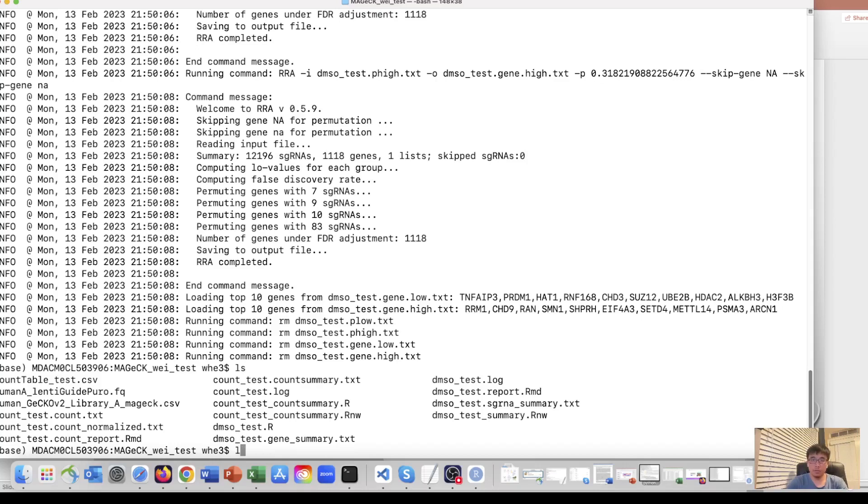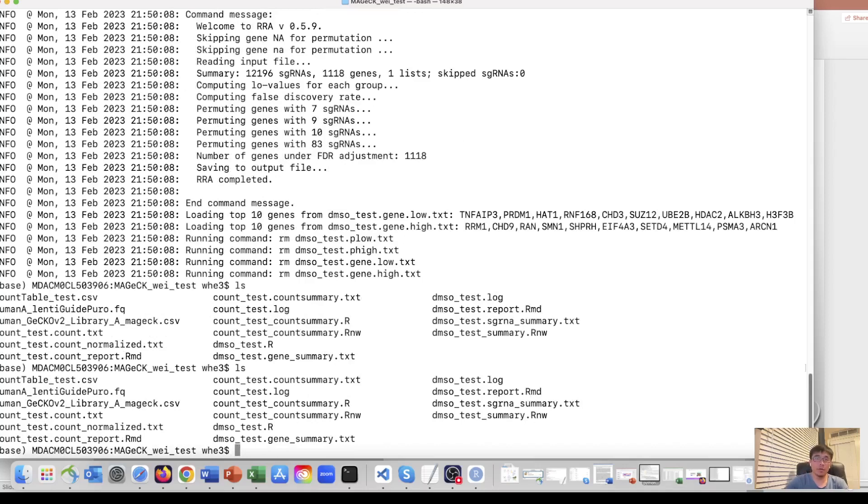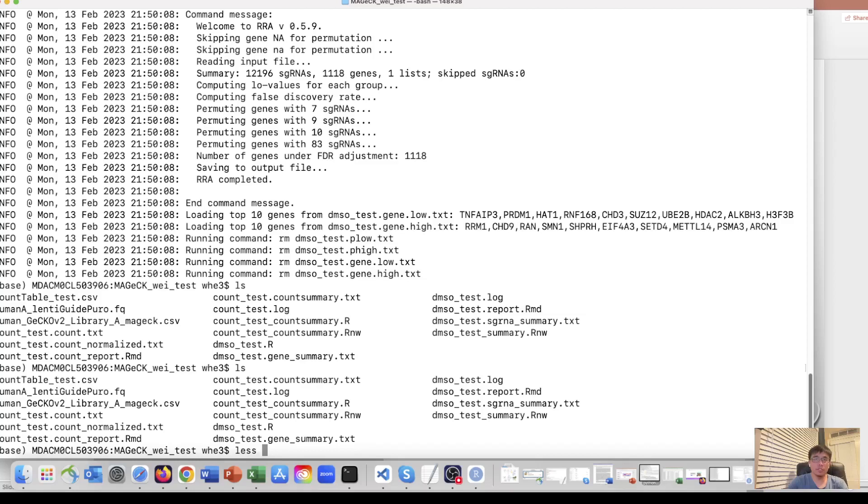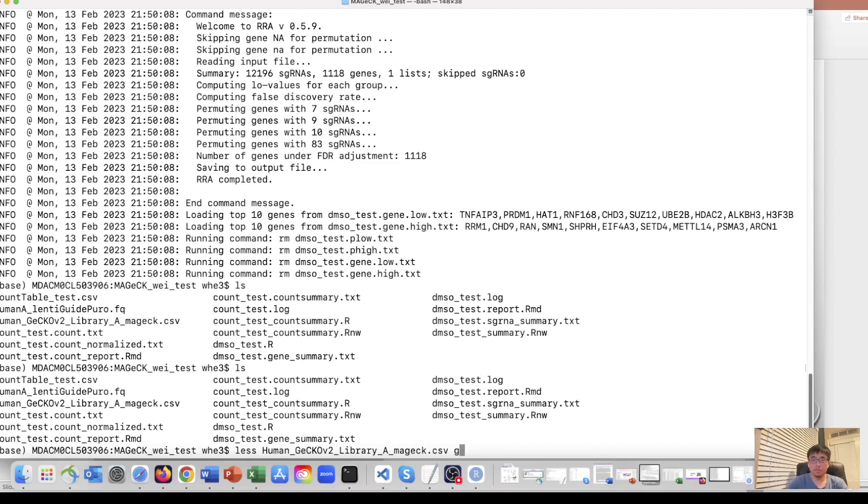I have built this folder called MAGeCK with test. In this folder, I have a fastq file. So this fastq file contains next generation sequencing of the plasmid for GeCKO2 library. Let's see what's inside.